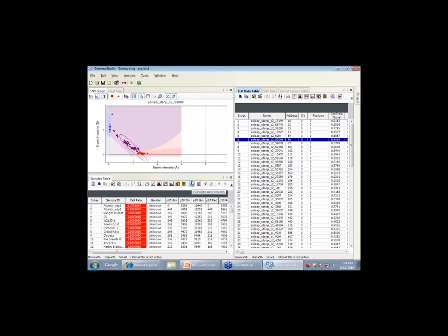Does Illumina make a mistake? Absolutely. Illumina is limited to the same problems we all are. It's garbage in, garbage out. If you have good markers, good primers, you're going to get good data. If your DNA samples are not great, if they're not normalized to a fairly uniform concentration and so on, that's going to affect how good your data is going to be.